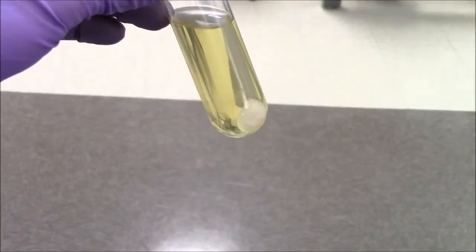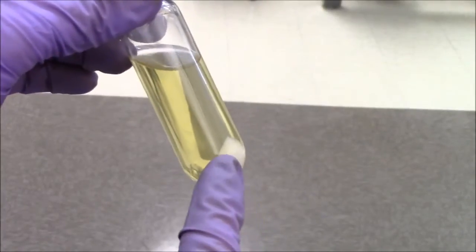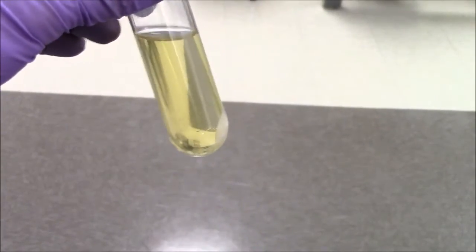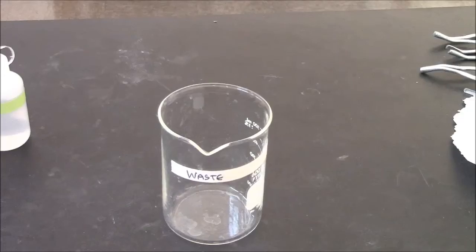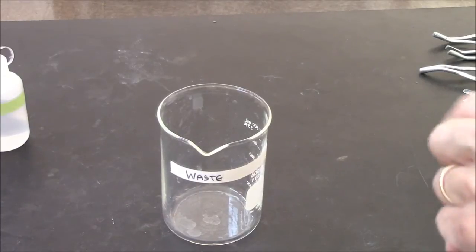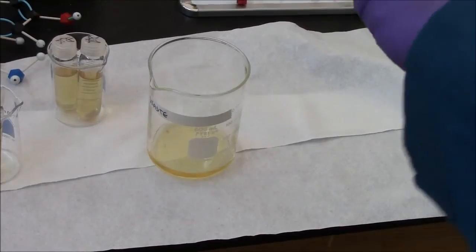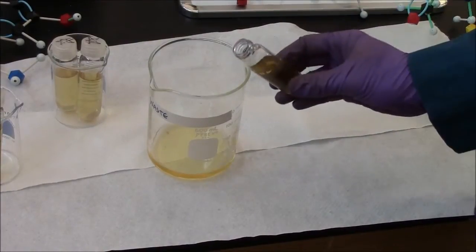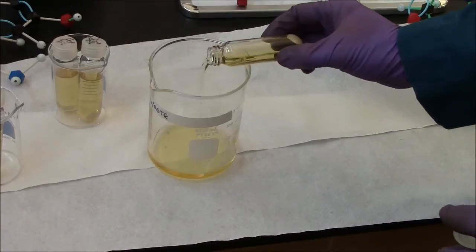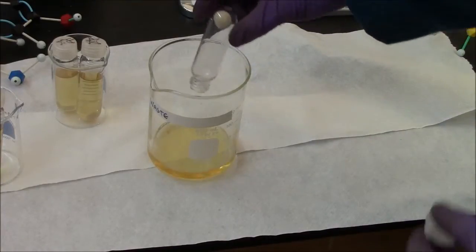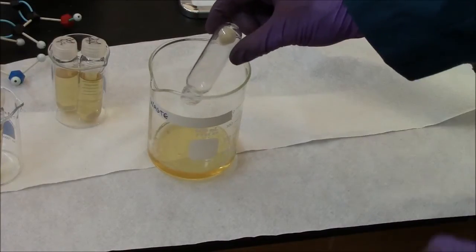So here's a sample that has bacterial cells pelleted at the bottom of the centrifuge tube. So there will be a designated waste beaker on the buffet table for you to pour out your broth. I'm pouring off the supernatant. You can see the bacterial pellet stays put.